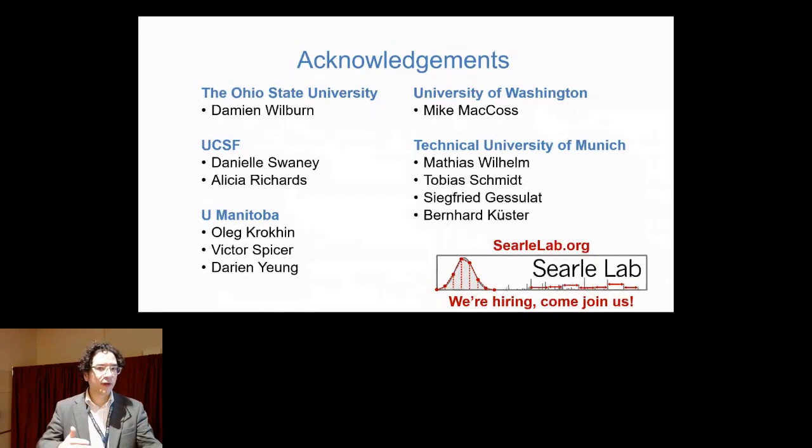That technology was well described in the Prosit paper, and we think it makes a lot of sense. That was our rationale. There are other ways you could think of this data, using transformers, but we find our approach is a nice middle ground.